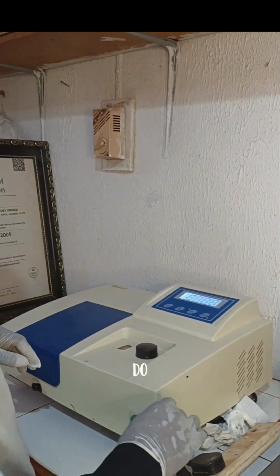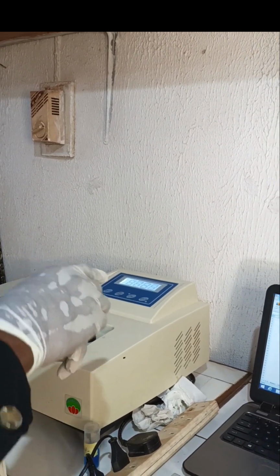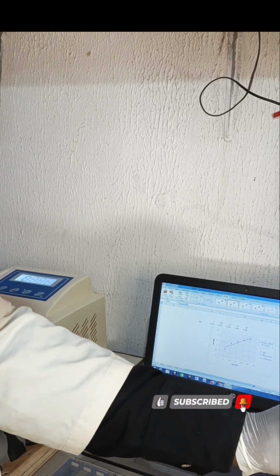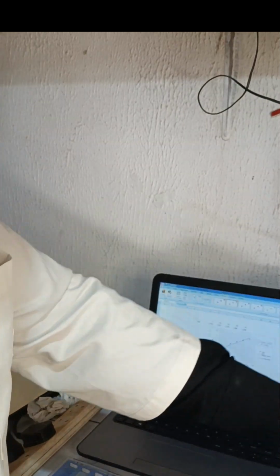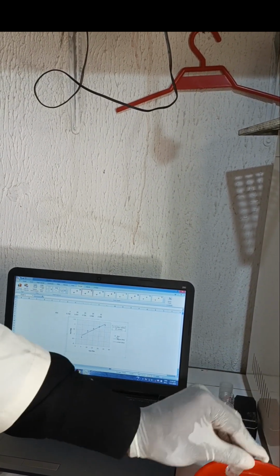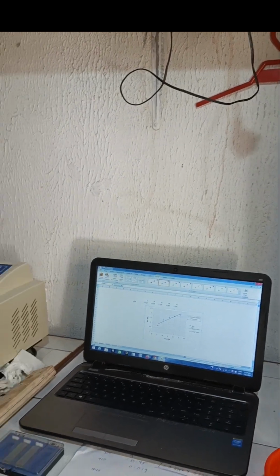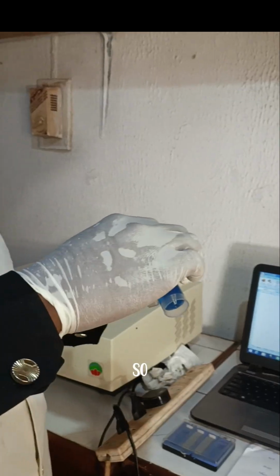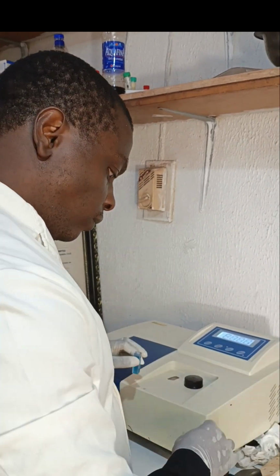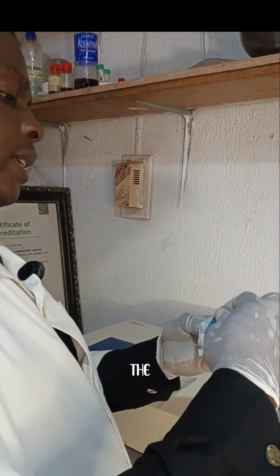So what we'll do is to measure the absorbance of the sample. So you can see that I'm trying to add the sample. As I add it, I still clean the light parts.